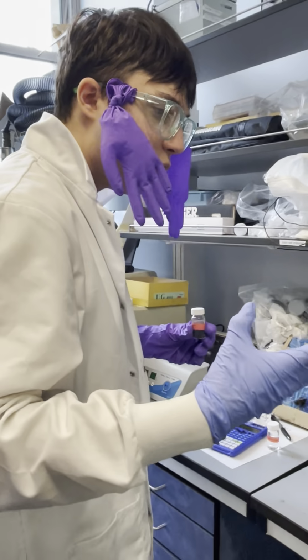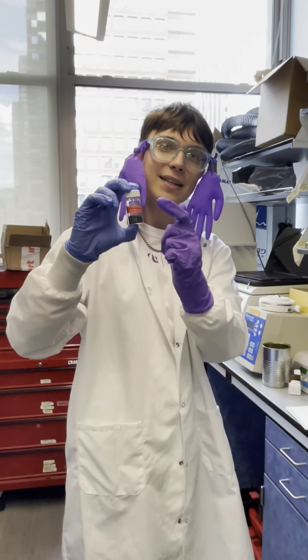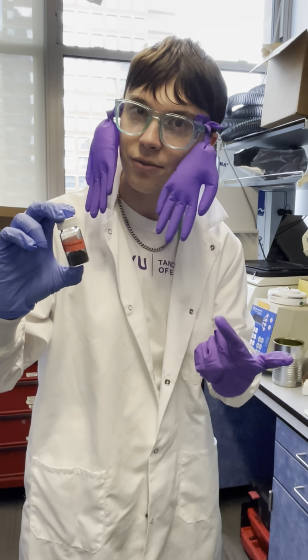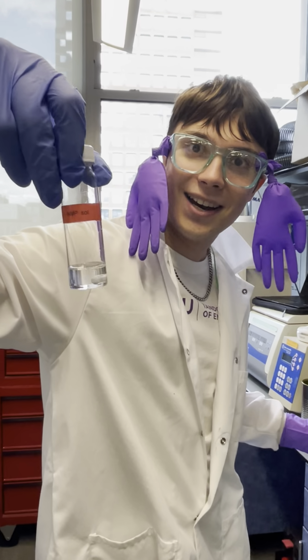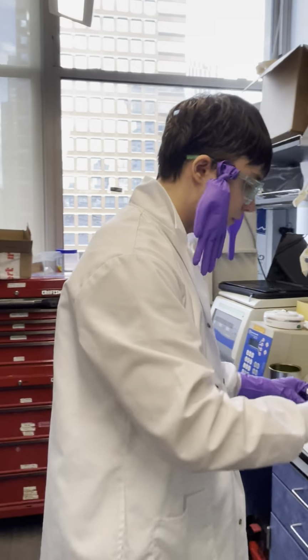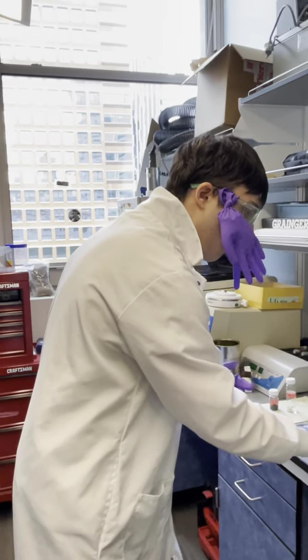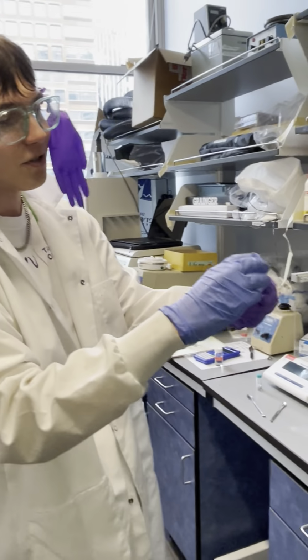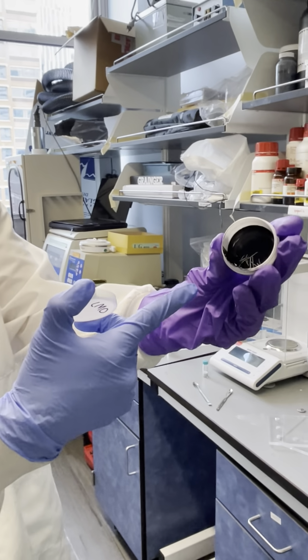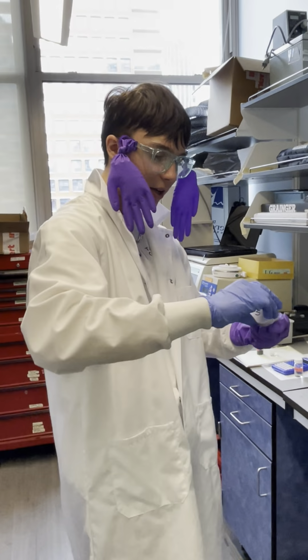So first, to make a battery, we have to make something called a slurry, which is a combination of this active material, because this is where the redox reactions happen, along with this PVDF in NMP solvent. NMP is a very widely known solvent, and this is just NMP in here. So we combine that all in a certain mass ratio to form this kind of slurry that looks like this. Very black, yogurt-like solution type mix. And same thing we do for LTO.